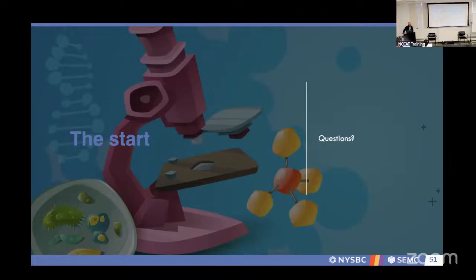No, my frame of reference is crystallography, and you can measure the signal to noise ratio of your spots and how far they diffract, things like that. I'm just curious if you can look at your image and have some parameter determine whether you like this detector more or that detector more.